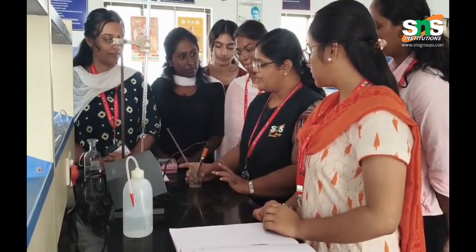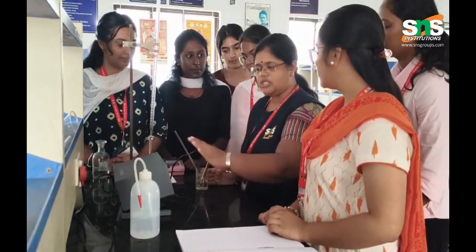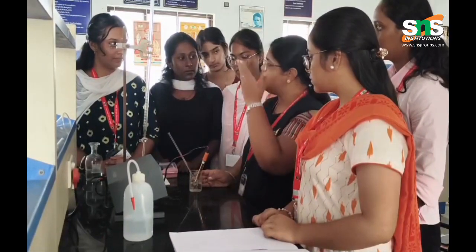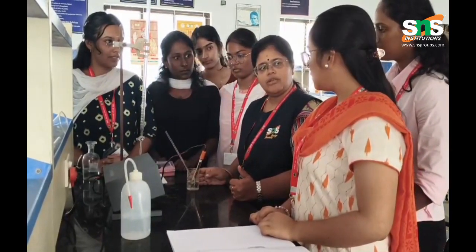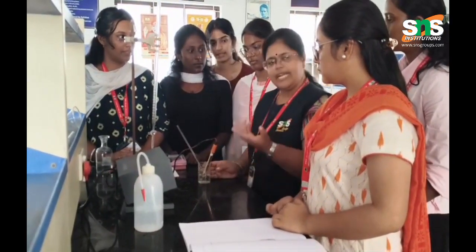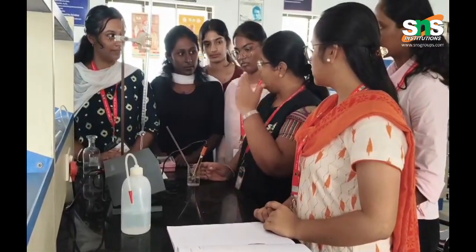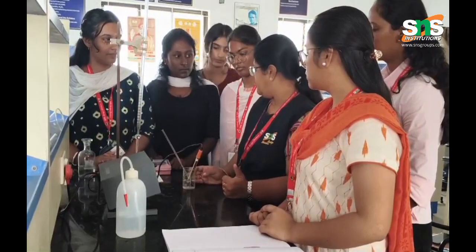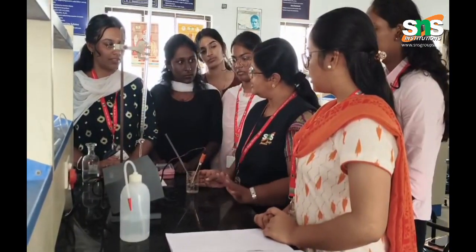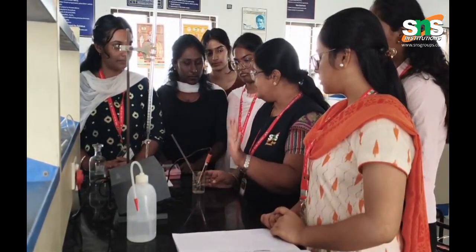Now we are going to find the strength of this strong acid and weak acid using conductometric titration. In the conventional method, that is, volumetric analysis, how do you do the acid-base titration? You add an indicator. What indicator do you add? Phenolphthalein. Very good. By the color change, you find the end point. So why do we use a digital meter here? To get accurate results.